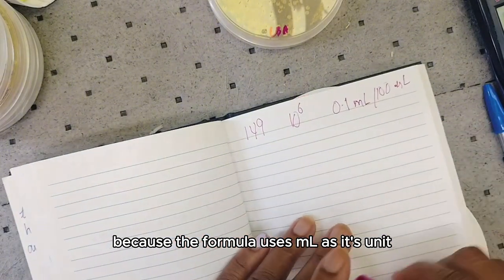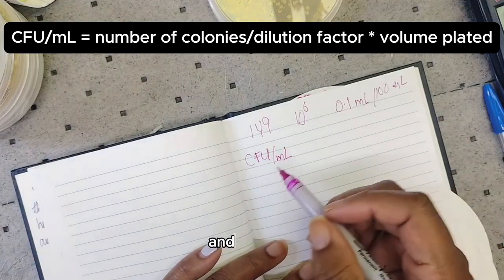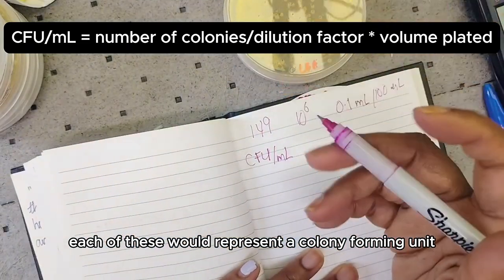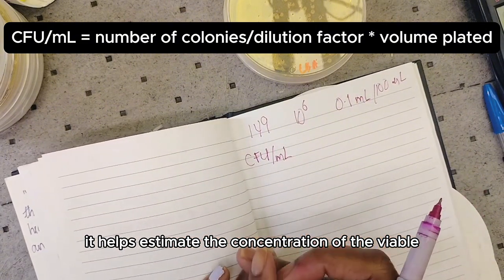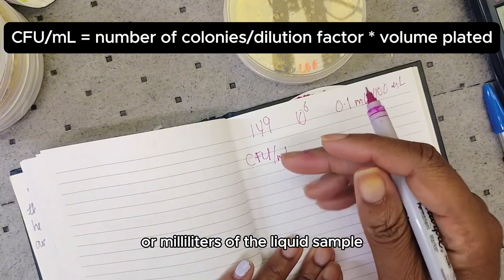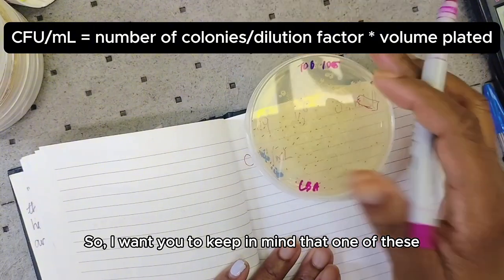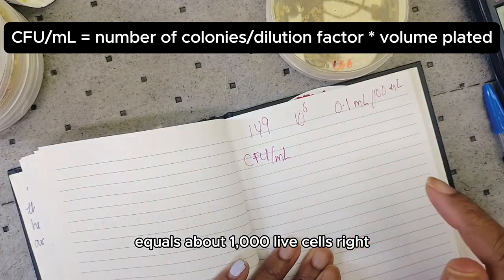The formula is CFU per mL — colony forming units per liquid. Each colony represents one colony forming unit. This formula estimates the concentration of viable microorganisms per mL of the liquid sample, based on the number of colonies growing on the plate. Keep in mind that one colony forming unit equals about a thousand live cells.